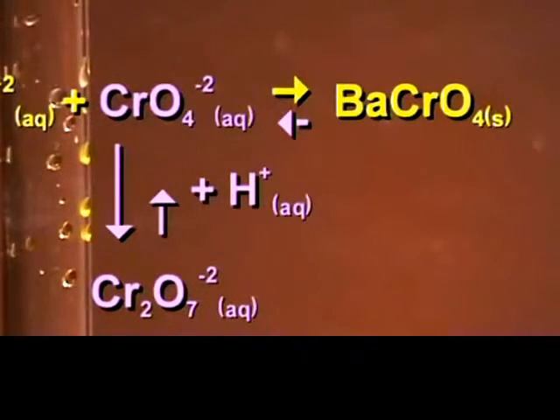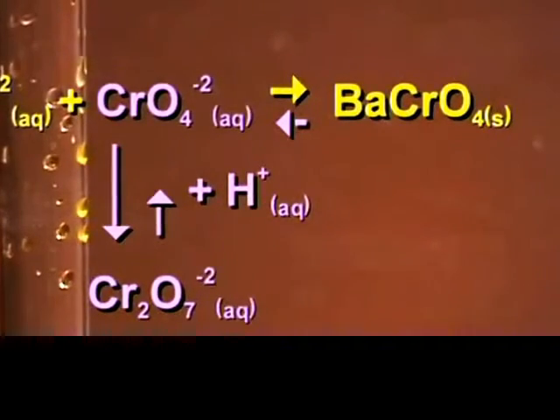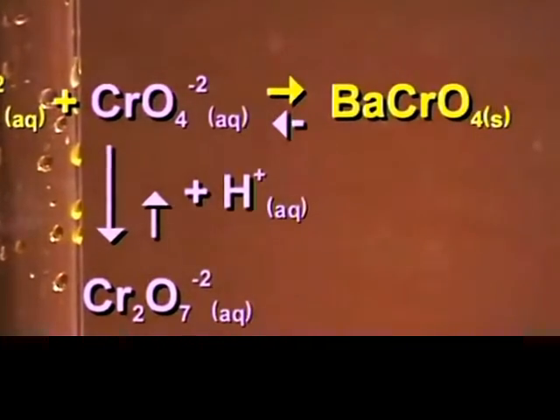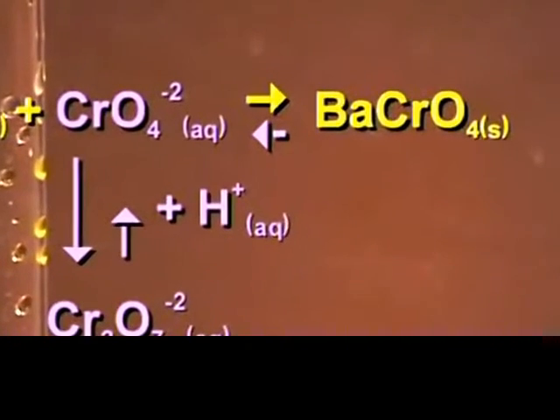As we add more and more hydrogen ions, the equilibrium is forced further in the reverse direction, and the solid completely dissolves.